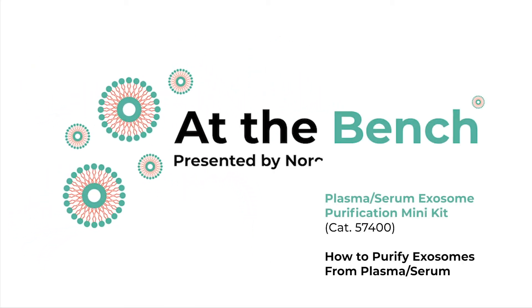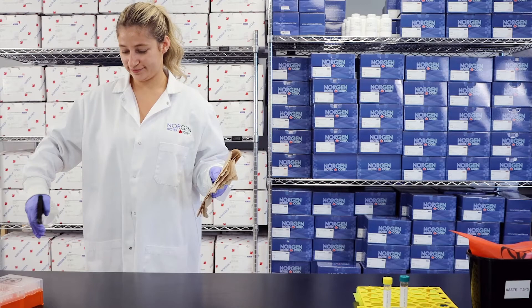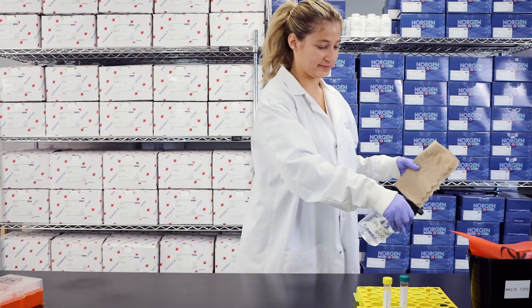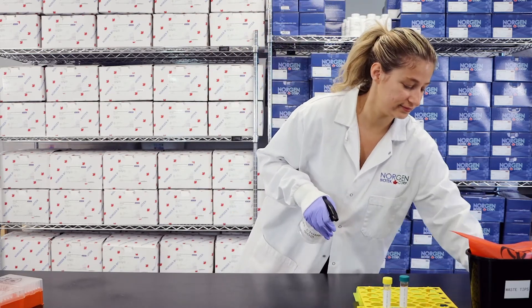Hi, you're watching At The Bench with Norgen Biotek. Today we will be demonstrating the step-by-step workflow for the Plasma Serum Exosome Purification Mini Kit, catalog number 57400.